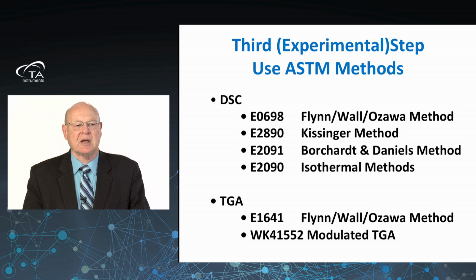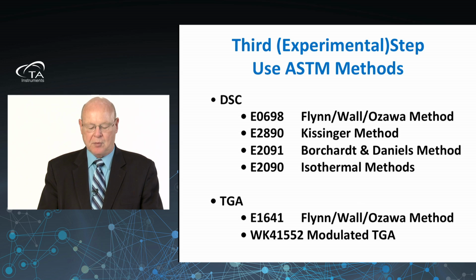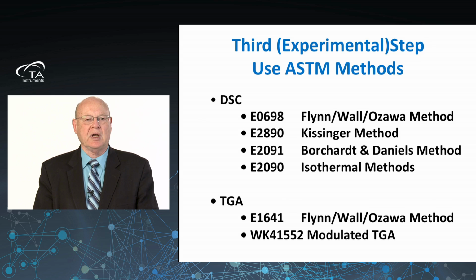So there are presently four ASTM standards based on DSC. There is one present standard for thermogravimetric data, with a fresh one on modulated thermogravimetry in preparation, and it should issue before the end of 2014.